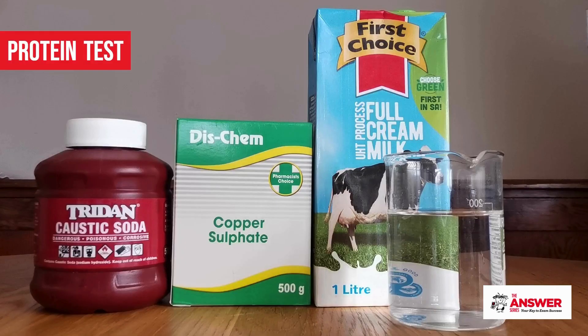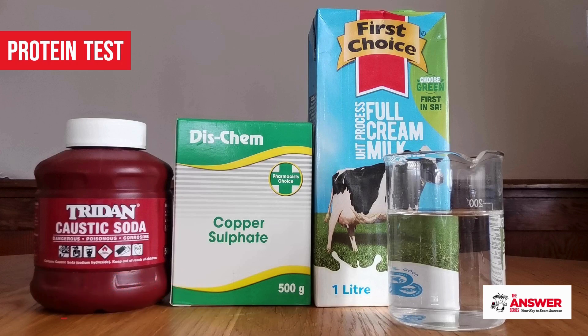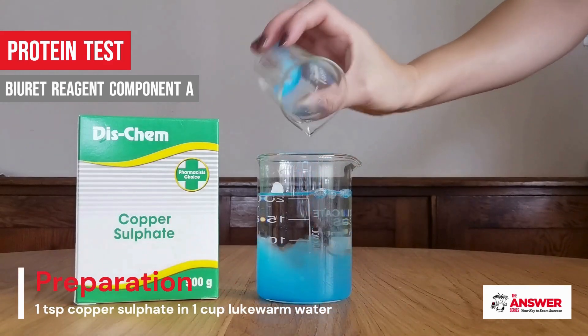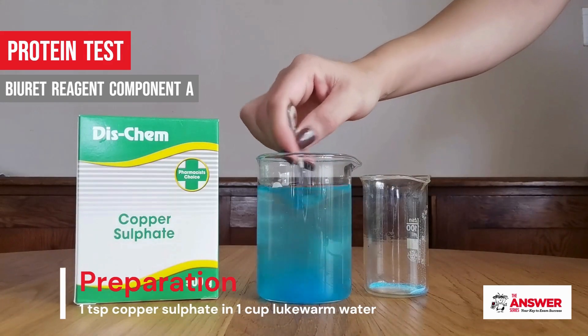For the protein test you need a protein-containing substance like milk or egg whites, and then you need to prepare the two components of the Biuret reagent. Component A is a solution of copper sulfate — just dissolve one teaspoon of copper sulfate in about a cup of lukewarm water.